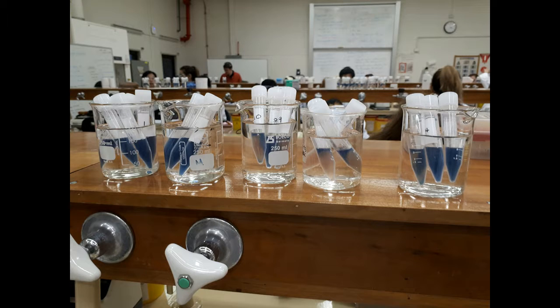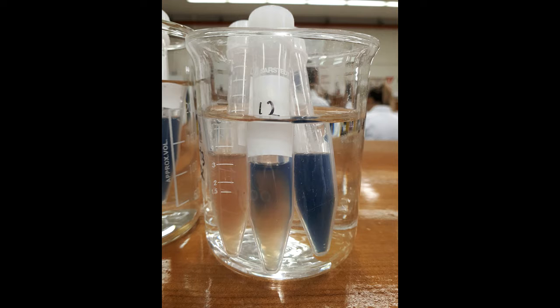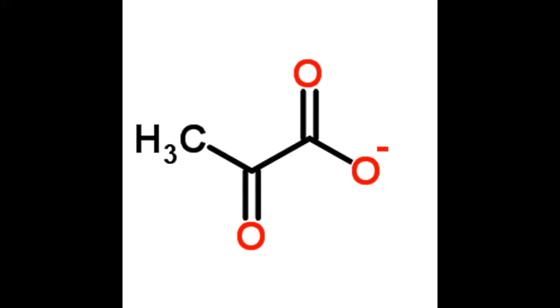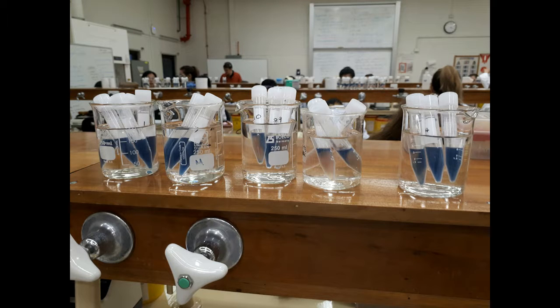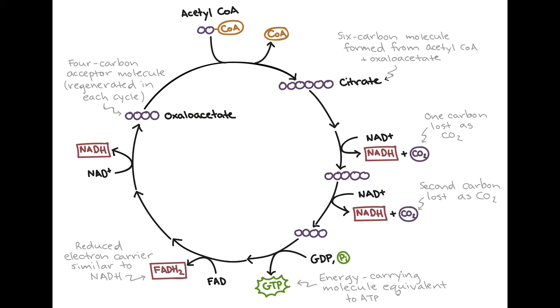We were tasked in performing the experiment to answer several questions. 1. The heart extract was unable to oxidize any of our substrates in the absence of NAD, with the exception of succinate, as the molecule upon oxidation does not require NAD to transport its electrons. 2. Upon addition of NAD, the substrates, with the exception of pyruvate, were oxidized by the heart extract. This is because pyruvate requires the presence of oxygen to enter the Krebs cycle to be oxidized, as well as various cofactors that weren't present in the given solutions.